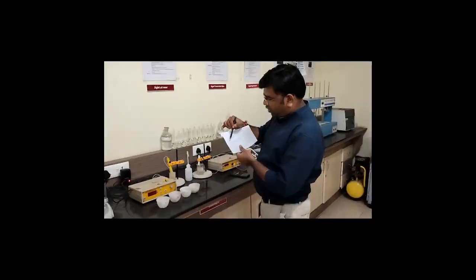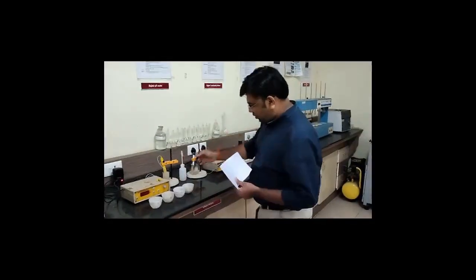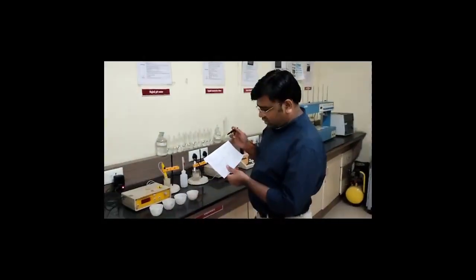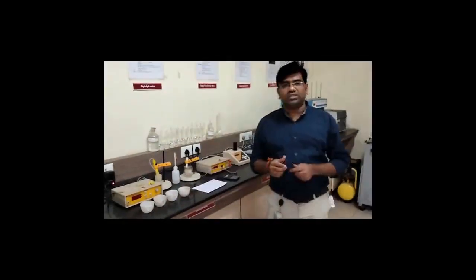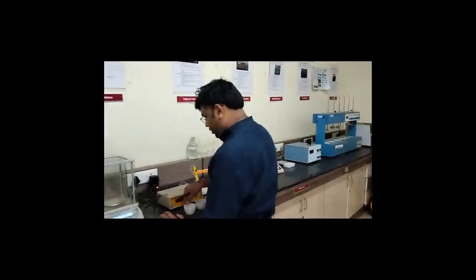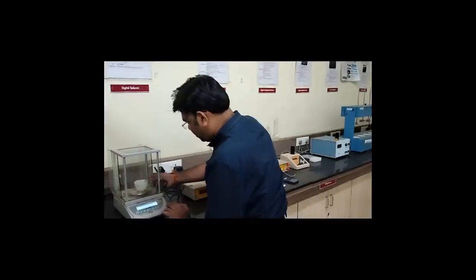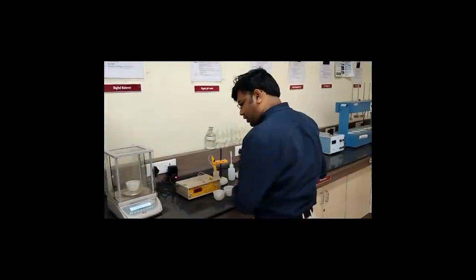Similarly, we are going to find out MLDS. For that also, we will have to take the empty crucible weights, and crucibles 3 and 4 are meant for finding out the MLDS. Again, the final weight will be taken by keeping these crucibles for 24 hours in the hot air oven in the temperature range of 103 to 105 degrees Celsius. So let's take the weights of all the crucibles. So it is 48.952.